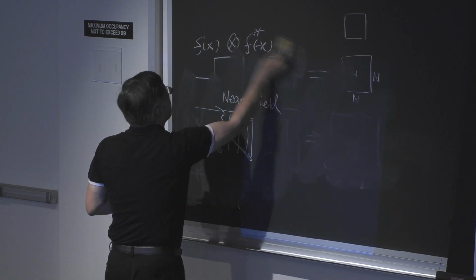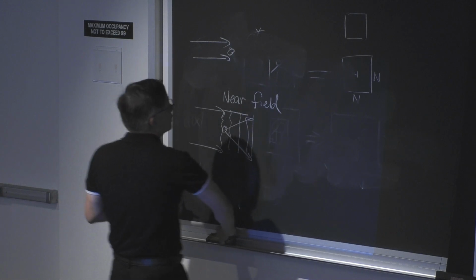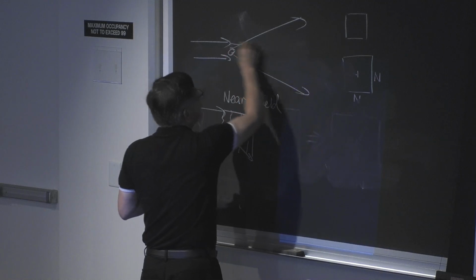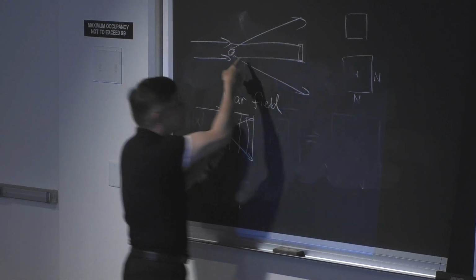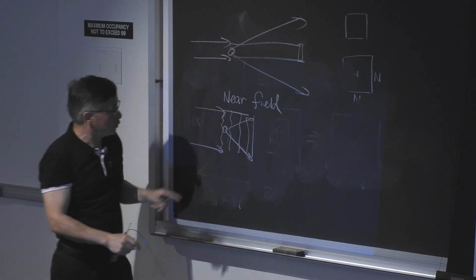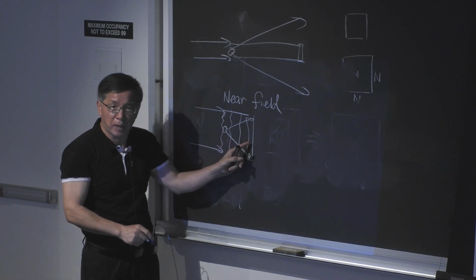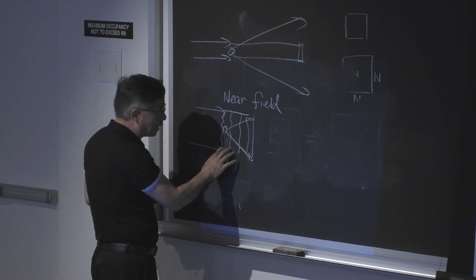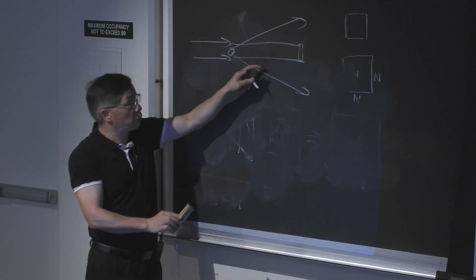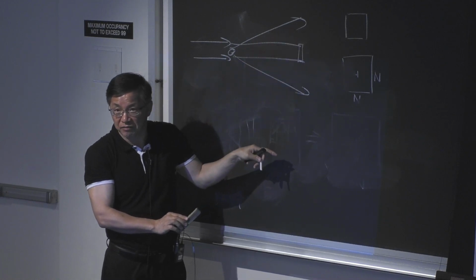But look, CDI is like this. In CDI we have a beam coming, we have an object here. We don't get interference, it's diffraction. The direct beam we actually block. Usually we call it a beam stop. The direct beam is completely blocked, and we only get diffraction from the sample. Here in holography the coherent wave has to interfere with the object to get an interference pattern. This is called inline holography. Then there's off-axis holography, which is completely different. We did not use this. The resolution here is much higher than the holography method.